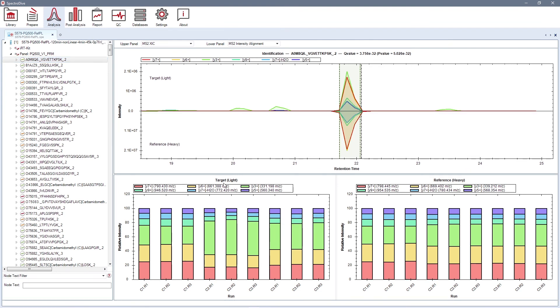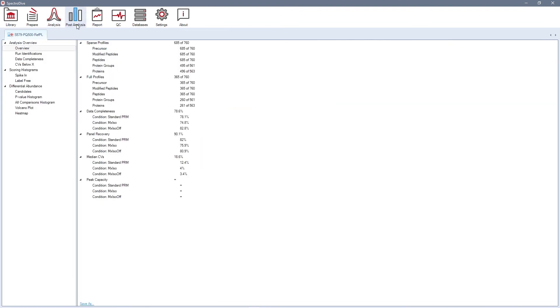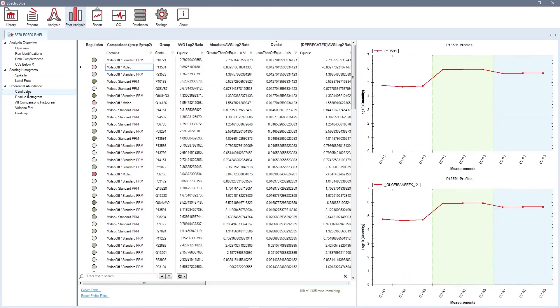In the post-analysis perspective, you can find, among other information, a list of differentially regulated proteins between experimental conditions. Information about ratio between target and reference peptides is available in detailed report.